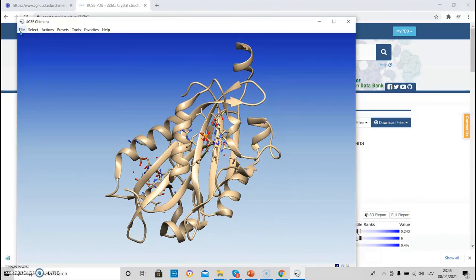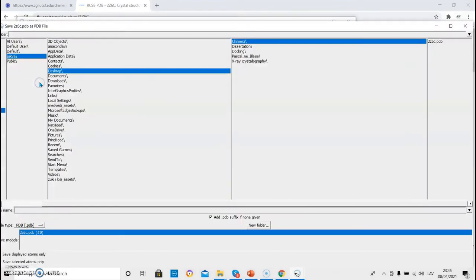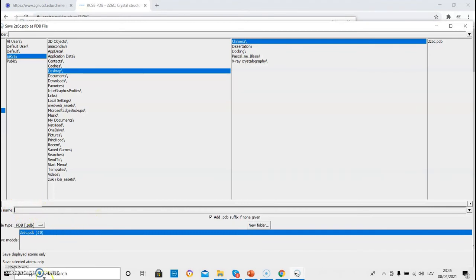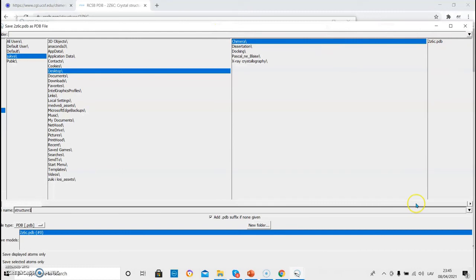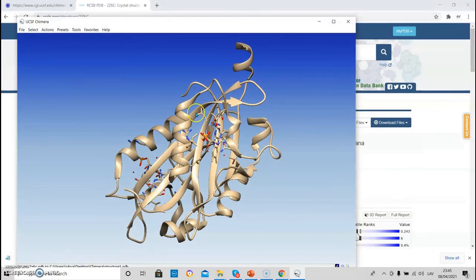To save the structure as PDB file, we can click file and save PDB. And you can save it as PDB file just by providing a name here. For example, one. And save.